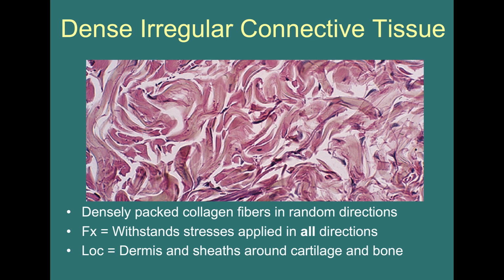So if there was a force coming out of the screen, if it was going to the right and to the left, from the top and the bottom, it's going to be able to resist those stresses in all those directions. We find this in our dermis, we find them around cartilage, we find them around bone. Next image, take a few seconds here and see what you notice that's maybe different in the last two. All right, one of the things that should be sticking out to you are these dark squiggly lines.